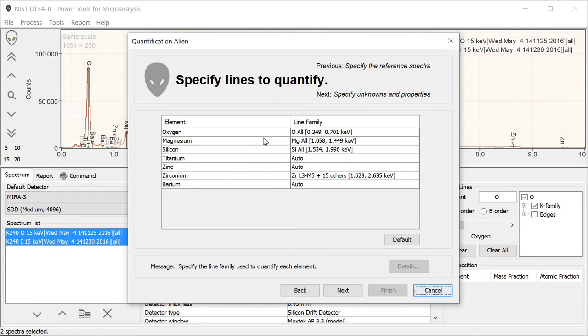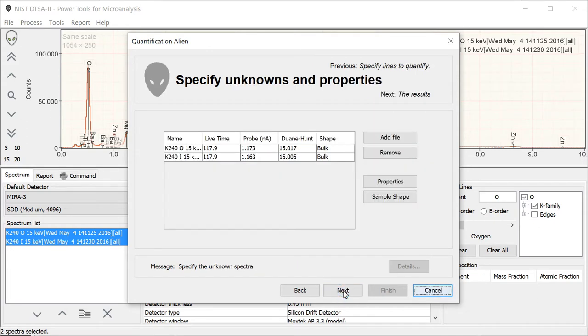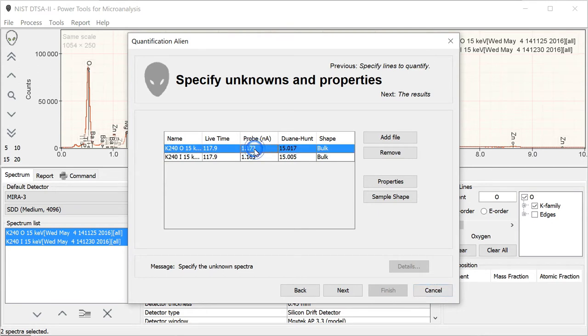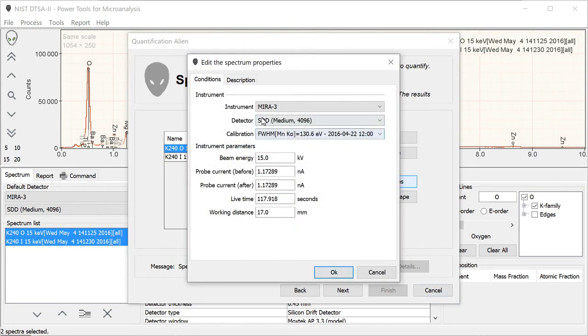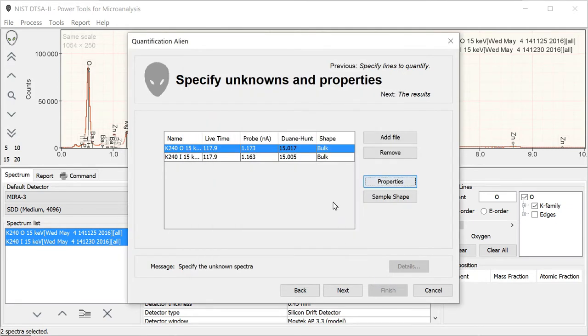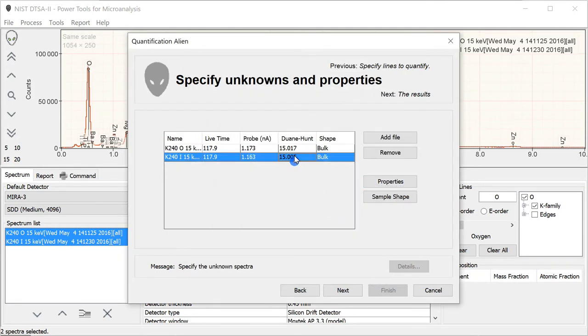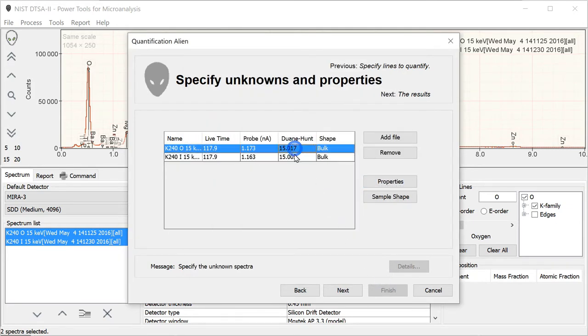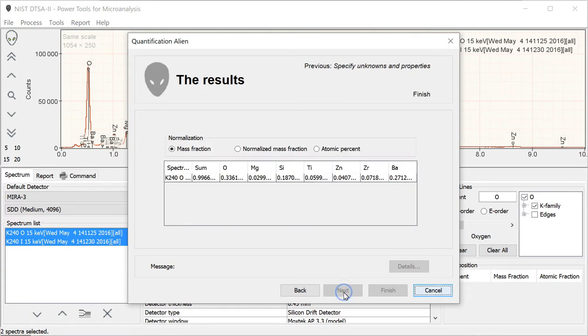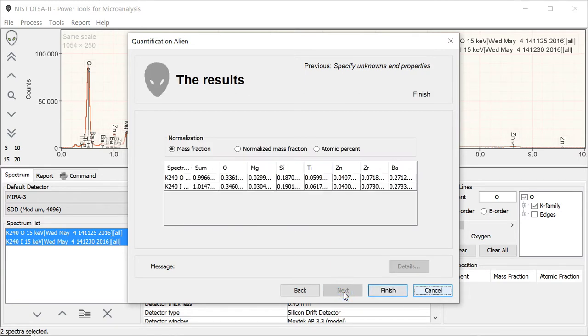You can specify lines to quantify, or you can just use auto. I'm just going to go with auto. We finally get an opportunity to make sure that all the information is correct in the unknown spectra. If it wasn't, you could go over here, select it, and edit the properties. Fortunately, this is good. So go on to the next page. And we get our results.